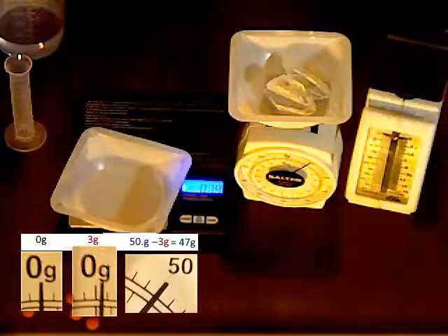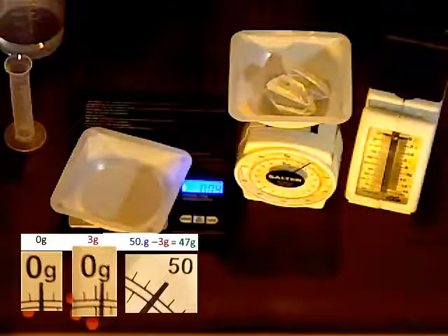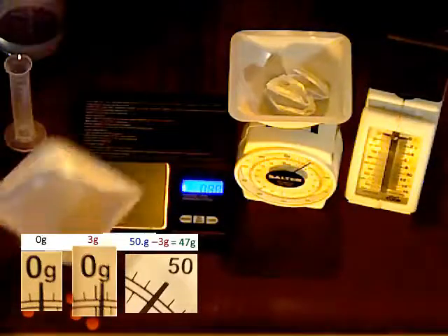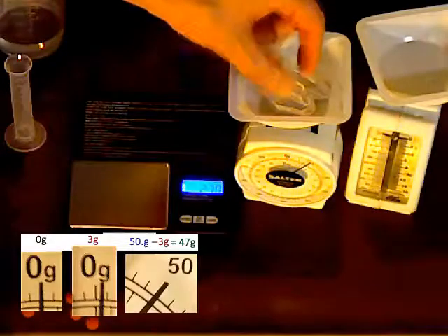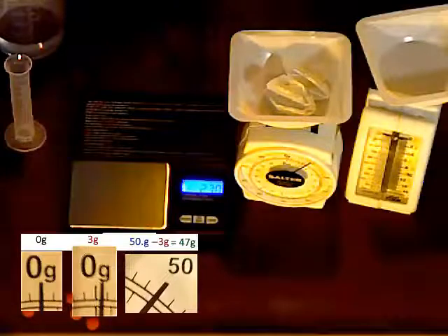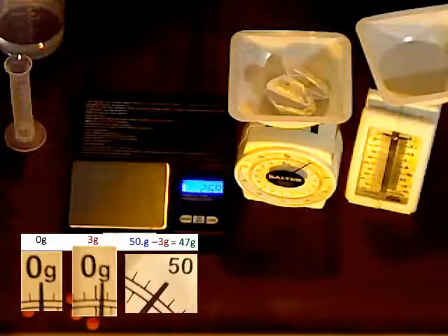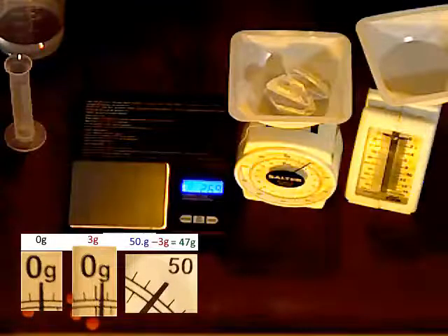From these measurements, I would interpret this as being 47 grams after I subtract the mass of the weighing boat. So 47 grams is the measurement this scale produces for the large pieces of quartz crystal. That's 2 significant figures. It is a little different than the digital balance. Nevertheless, it is a measurement. Assuming that this scale is correctly calibrated, this reading would be 47 grams.